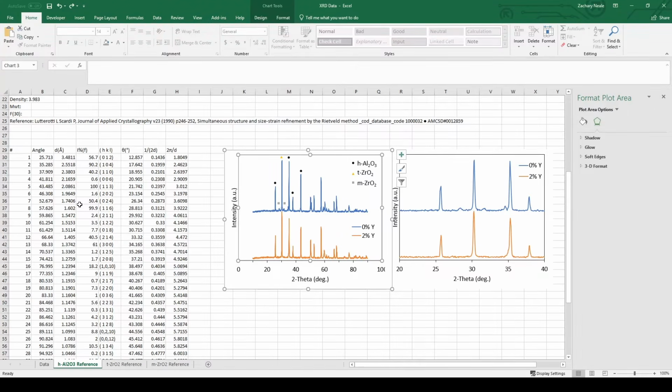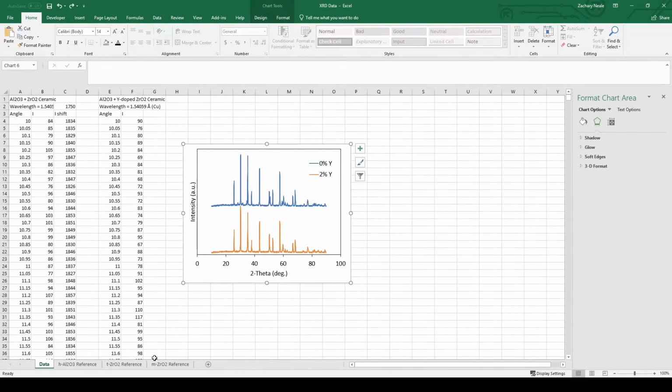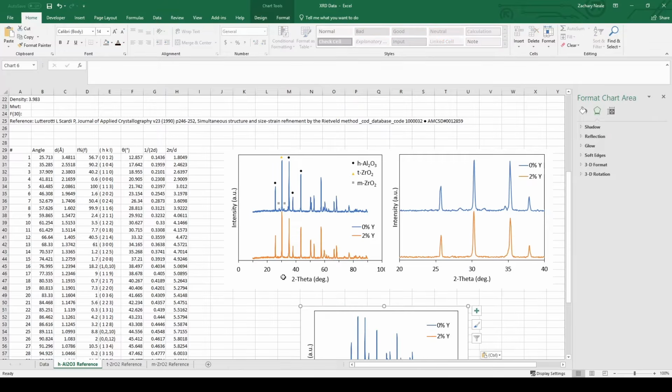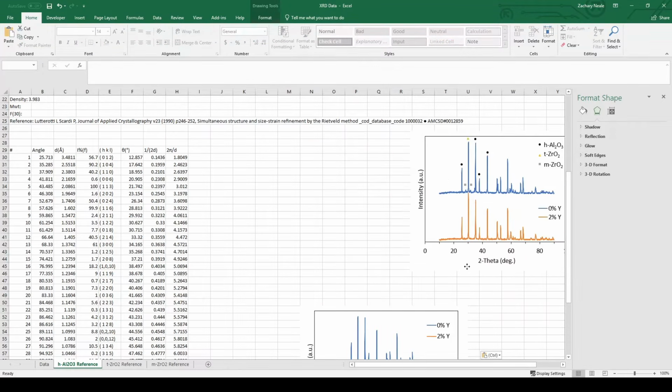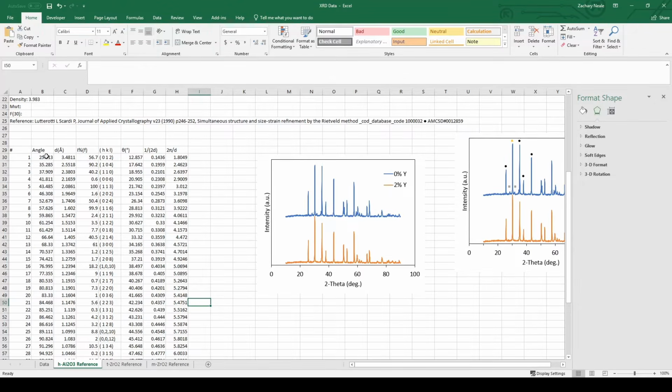Okay, so essentially we're going to add each reference as a series to the plot. I'm going to start with a new graph without the icons. Move this over. But in order to do that, we need to add a line before and after each of these reference angles.